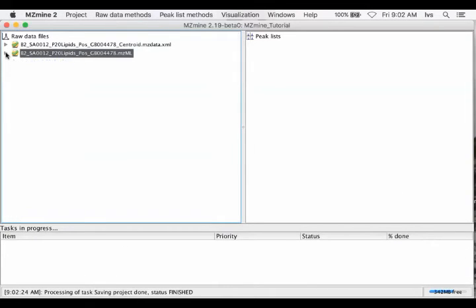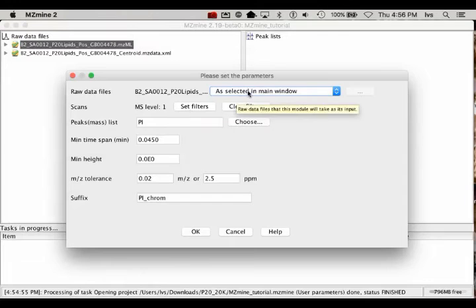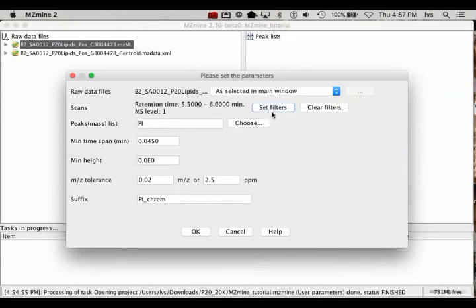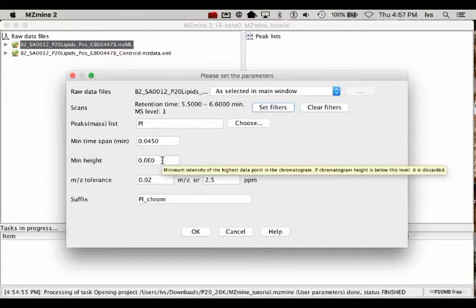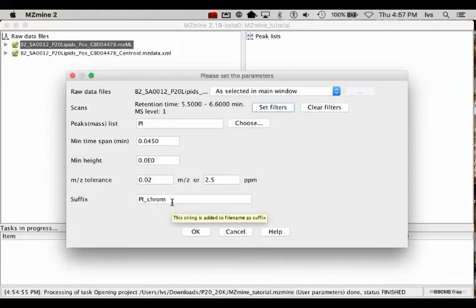Now that we have the spectral mass lists, we can use the standard MZmine features to build the LCMS chromatograms. This process compares the mass lists from each spectrum, aligning those centroids within a specified mass tolerance into a chromatogram in the time domain at that mass. We limit our chromatograms to the retention time region of interest in this study.